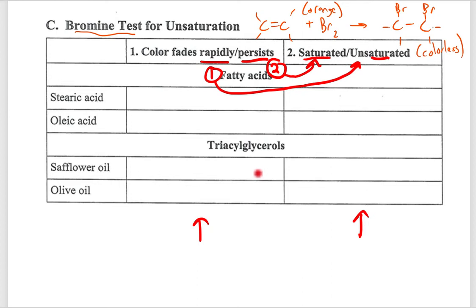Basically, you're testing for the degree of unsaturation in these different samples. By the way, just with the notation and the language here, you can anticipate what might happen. And you can easily look up these two molecules to anticipate what's going to happen as well. But again, it's a really fast video, and I think that's enough. So let's watch the video.